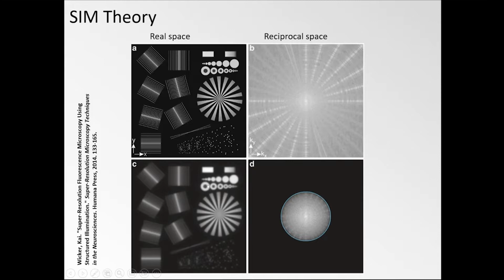A real microscope, however, doesn't see the true fluorophore distribution. It essentially sees a downsampled version, a blurry version, as shown below. And in frequency space, this corresponds to a low-pass filter. So within this blue circle, those are the observable frequencies or Fourier components of the sample, and they're a subset of the lower frequencies. The higher ones you will not see. That's just limited by diffraction. So this out here is, if you want, the Abbe diffraction limit, and higher frequencies simply cannot pass.